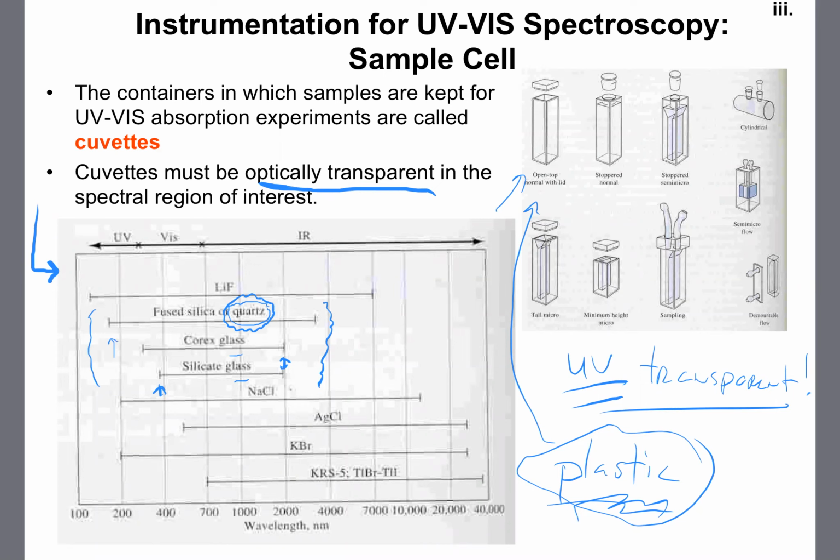Doing so would allow you to probe the UV. However, these quartz cuvettes can be pretty expensive. Historically, you might buy them in what's called matching pairs, for reasons that we'll understand as we progress in this chapter. A matching pair, a set of two that are almost identical, might cost you $500 or $600.